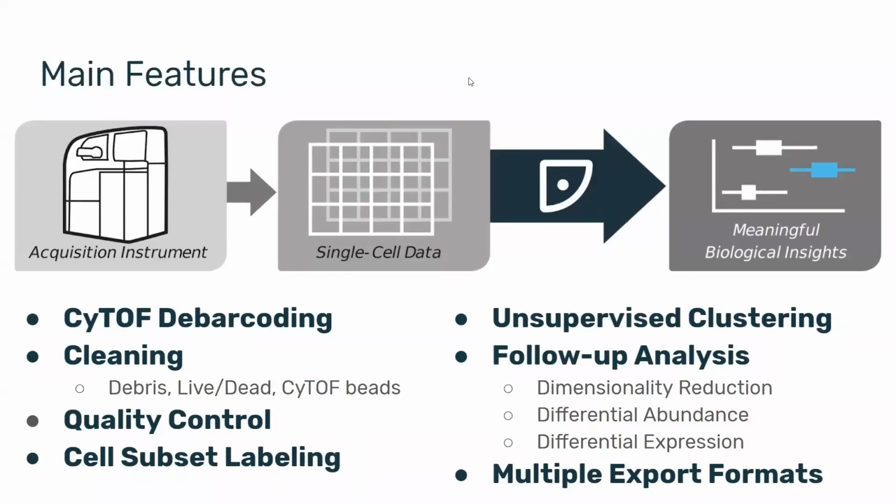So it's quite a lot. Unfortunately, we can't go over all of it today. So I'm going to focus on what I believe is the heart of the research project, which is the follow-up analysis. Really, this step that lets you focus on the high-level ideas and on the biology in your data.